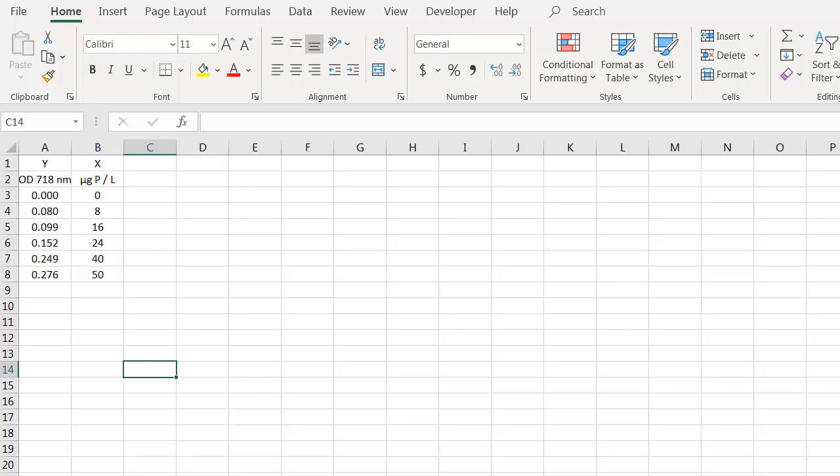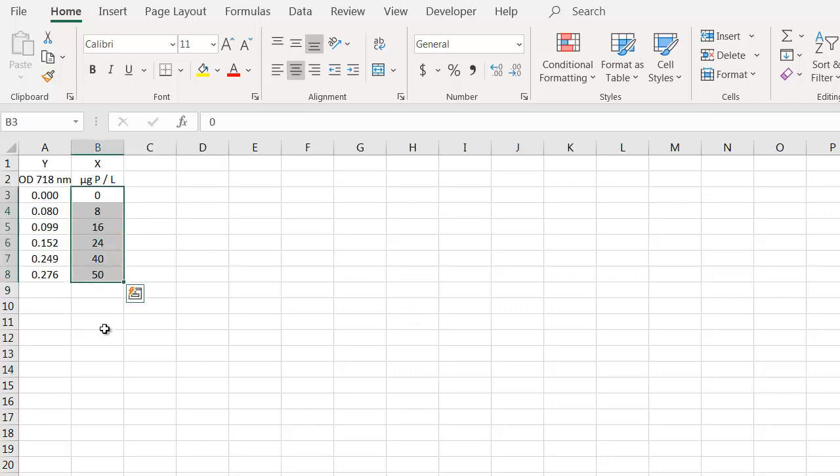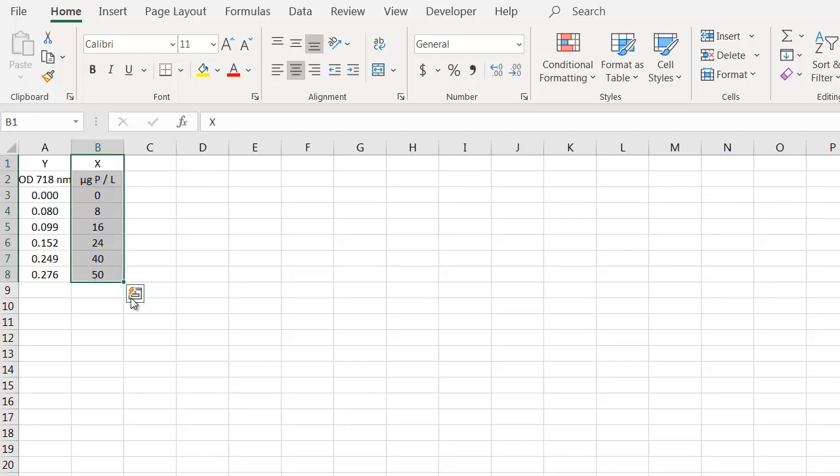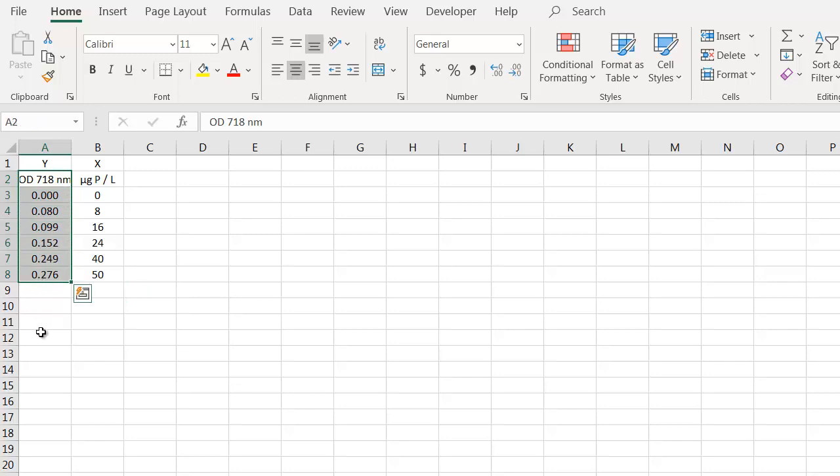Now, in this particular example, this data generated by some of my students, in which they were using a spectrophotometer to measure the concentration of phosphate in water at local ponds at our university. So to do this experiment, they first needed to set up a standard curve. These values right here are the phosphate standards they were used. And the units that measure is micrograms of phosphorus per liter of water. We're going to call that the x-axis. And for the y-axis, we're going to have optical density measured at 718 nanometers.